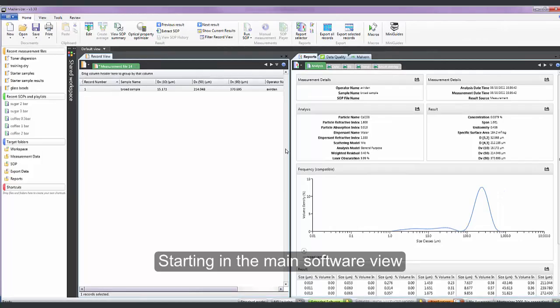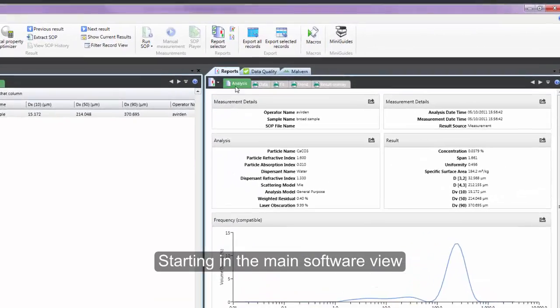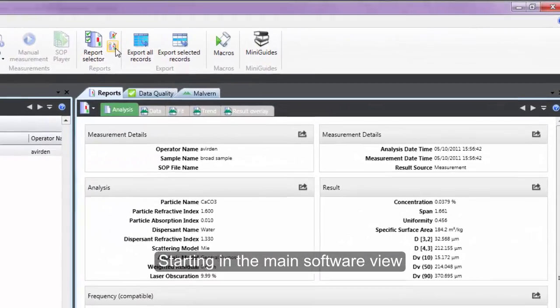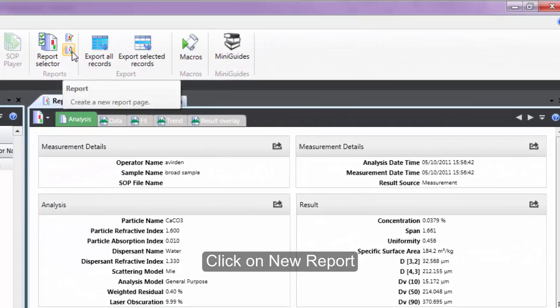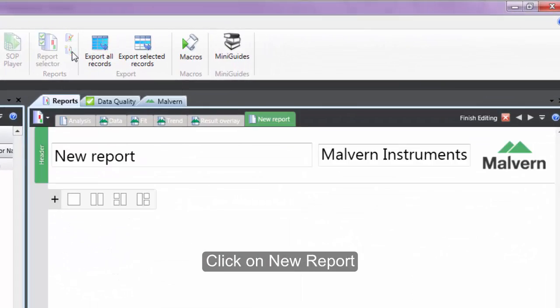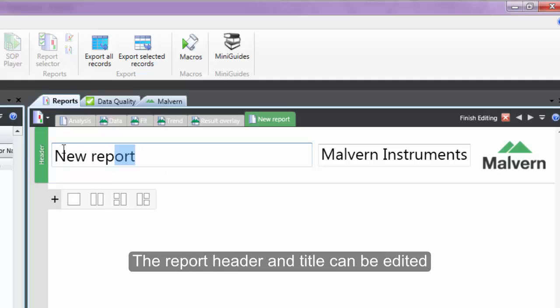We start in the main software view and in the report section click on new report. We can start by giving the report a title and here we are going to create a report for analyzing soil samples.